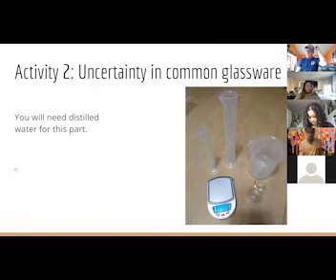So now we sort of get to the meat. Again, you don't have to rush along, and you can do these measurements later. Basically, what I want to do is go through the whole thing and answer any questions you might have. Do your experiment now, and then do your calculations later. Do your measurements now, then your calculations later.